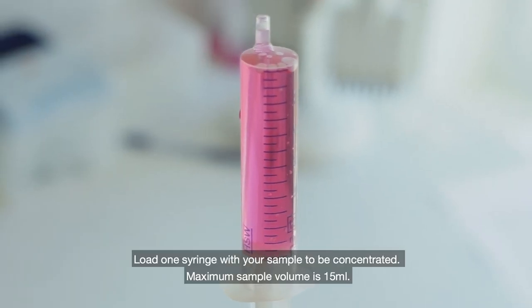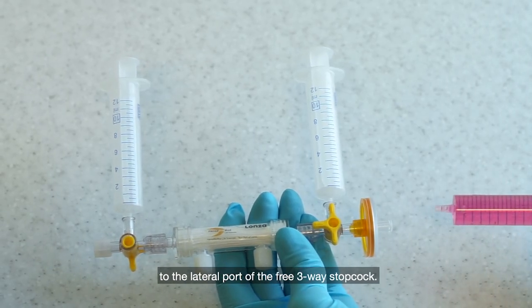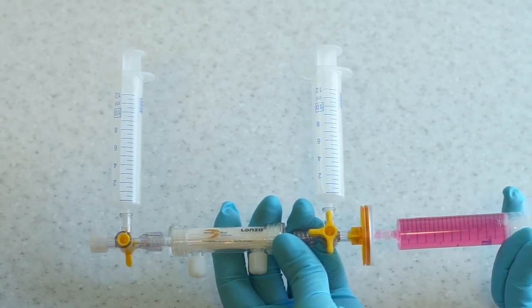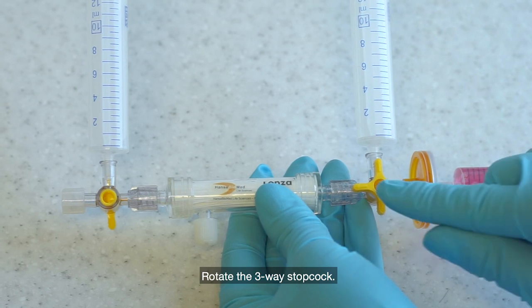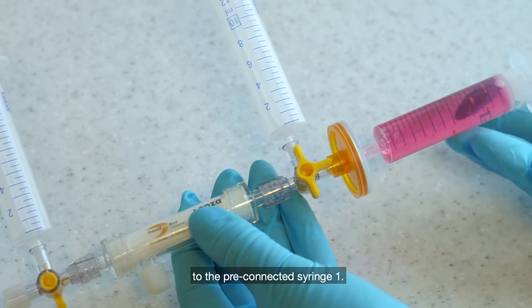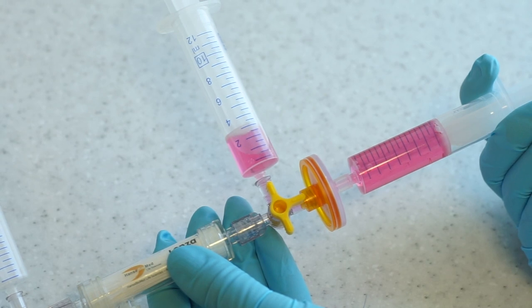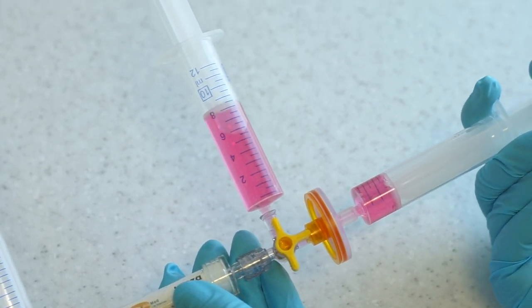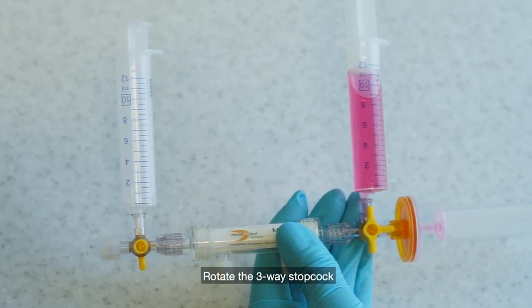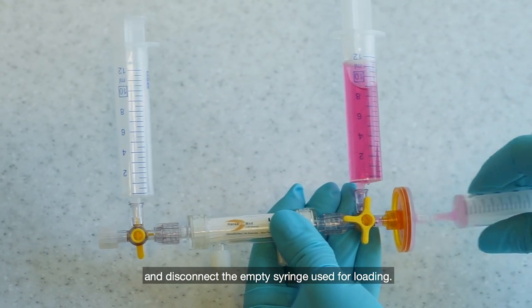Load one syringe with your sample to be concentrated. Connect the syringe with your sample to the lateral port of the three-way stopcock. Rotate the three-way stopcock and load the sample to the pre-connected syringe one. Then rotate the three-way stopcock again and disconnect the empty syringe used for loading.